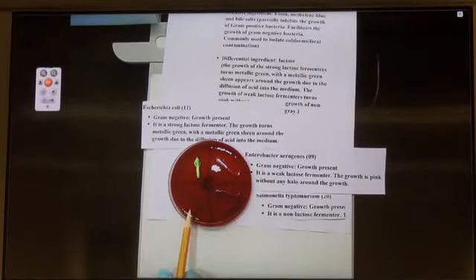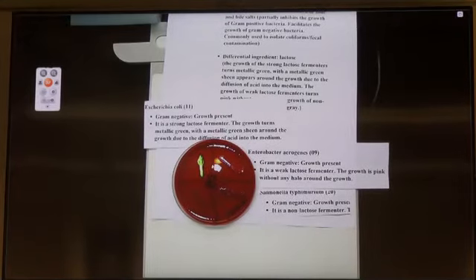How many numbers would you assign this? 3? Okay. So poor growth here, abundant growth. 1 or 2, so little growth here. Okay, so let's go to the chart. Fill out the chart on page 106, please.